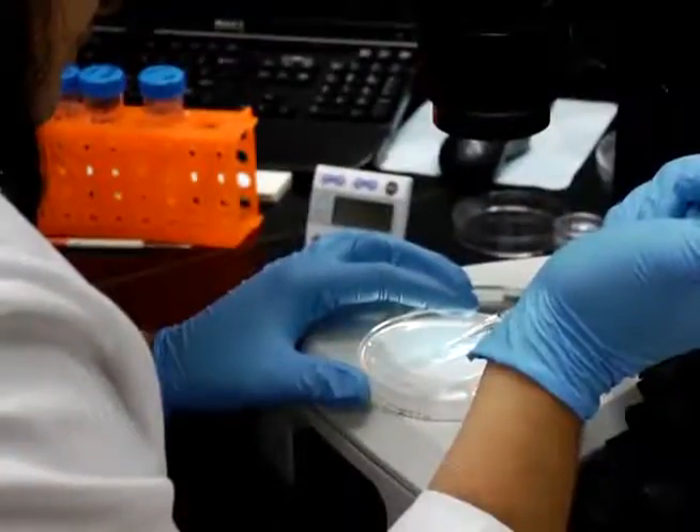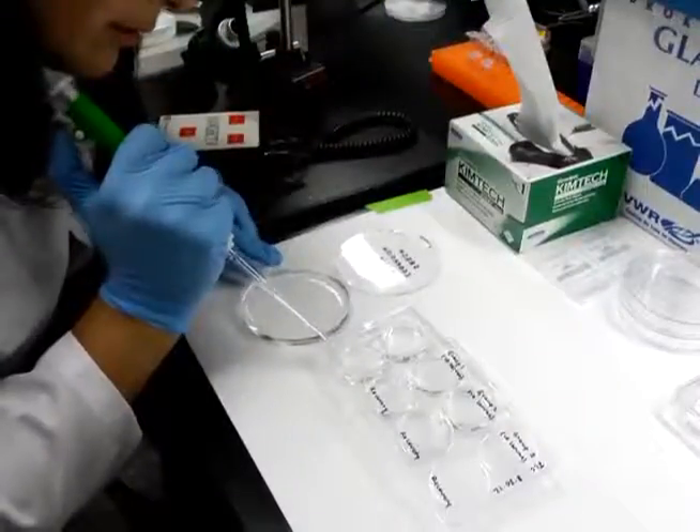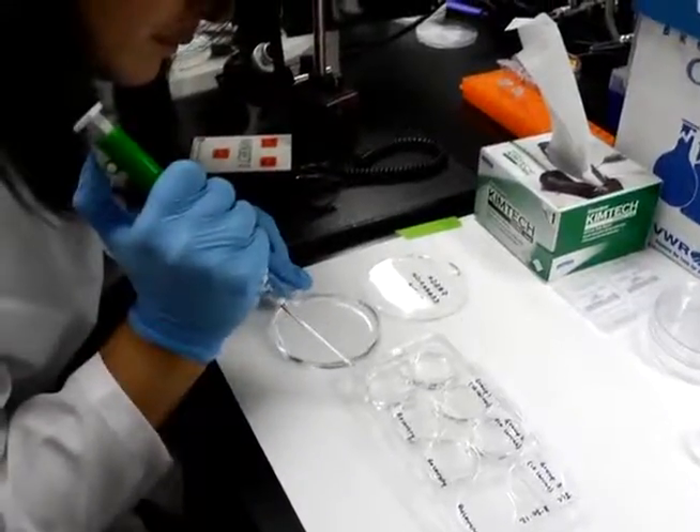After removing the gavage needle, transfer the fish to a dish containing fresh media. Transfer the larvae to a petri dish or six-well plate until needed for subsequent analysis.